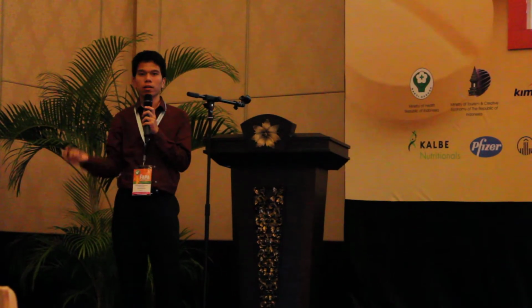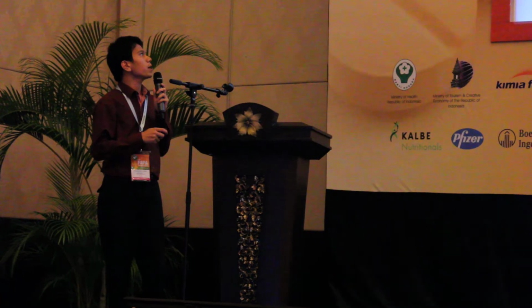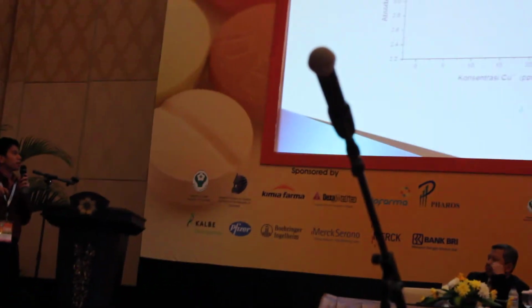And if you want to keep the indicator, don't mix the sodium chloride 1 molar into the indicator beforehand for a long time. You have to immediately pour the sodium chloride into the indicator first and immediately check it on the analyte solution. And we did the trial for the red alga, Kappaphycus alvarezii, and we got the smallest concentration at 1 ppm, and with LOD and LOQ like this.